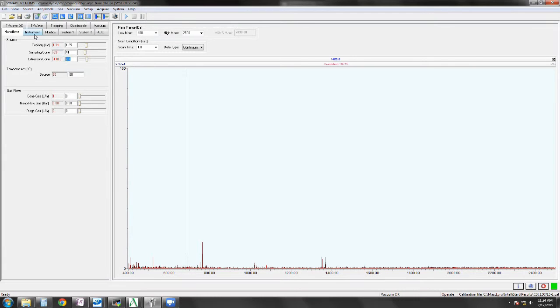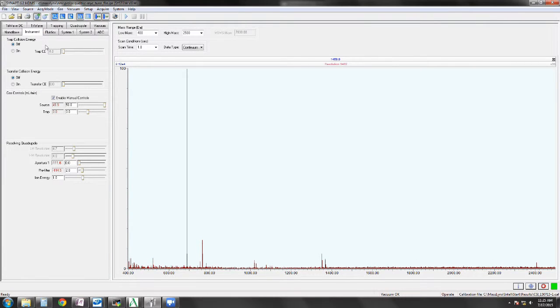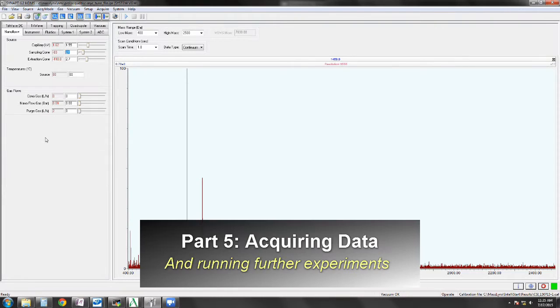The temperature we're going to leave as it is. We can also alter some voltages inside the instrument. So we can alter the energy in the collision cell. Some systems like a bit more energy transfer. By putting more electron volts in the collision cell, we get slightly better transmission. And we can also alter the gas in the source from 15 down to 10, no great change. Now our sample is spraying well enough.